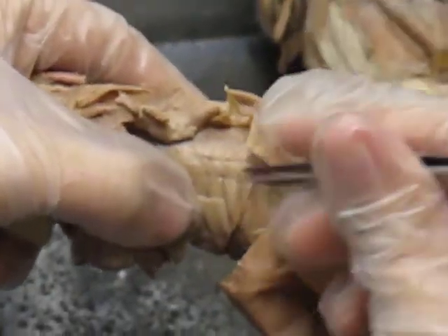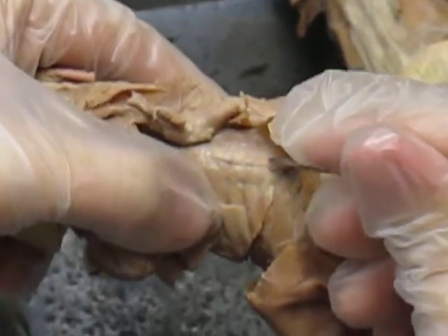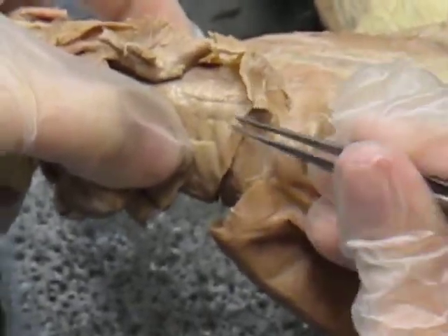On top of your ceratus dorsalis is this clear white tissue. That's your aponeurosis. Aponeurosis — it's this clear, whitish connective tissue.